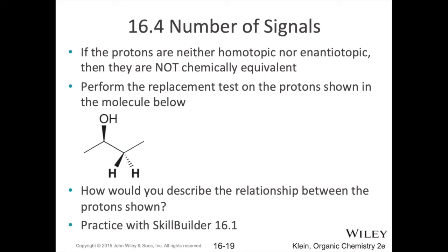Okay, so have a look here, and look at these two protons here. Well, we'll ignore the proton that's on our alcohol group for now. Let's look at just these two protons here. Of course we're going to ignore the protons on our methyl groups and the proton that's over here. Would these two protons be homotopic, enantiotopic, or neither? Okay, so try pausing this video, replacing these two protons, and comparing the models of them, and ask yourself, what is their relationship?